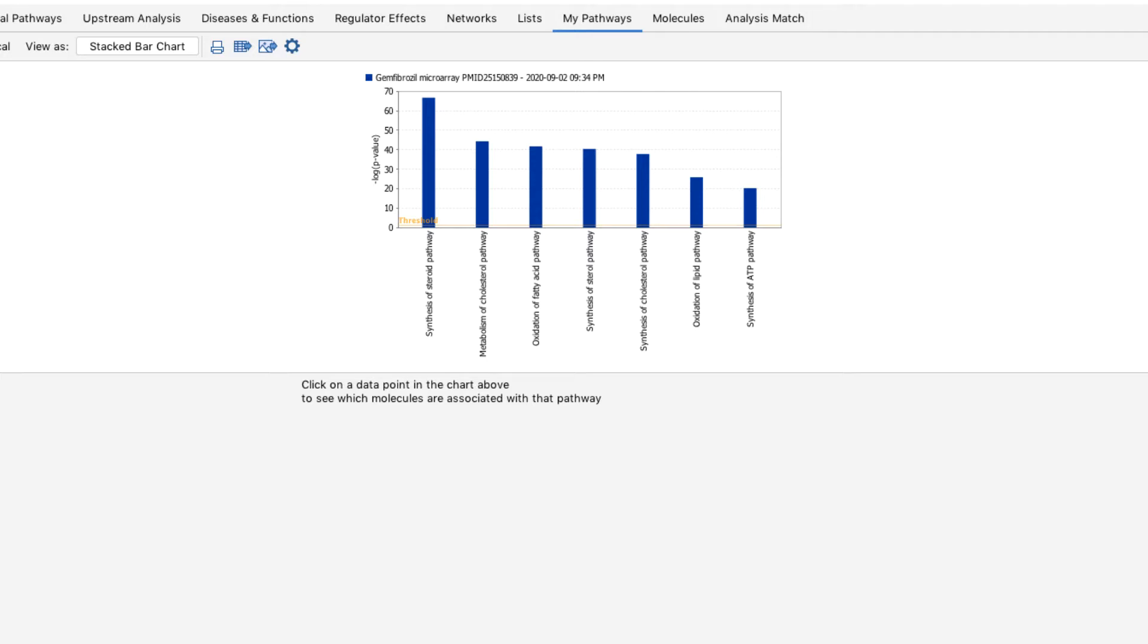MyPathways are often created by IPA users focused on subjects such as immune cell functions, toxicology, or other specific disease areas.